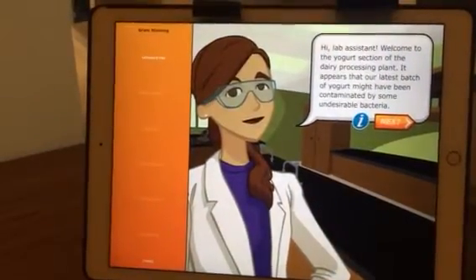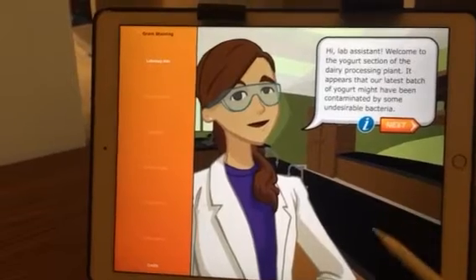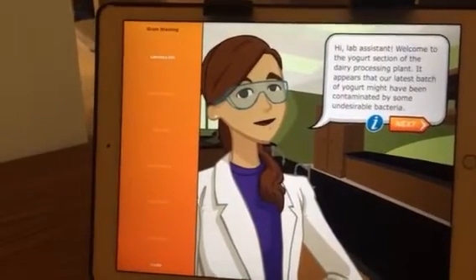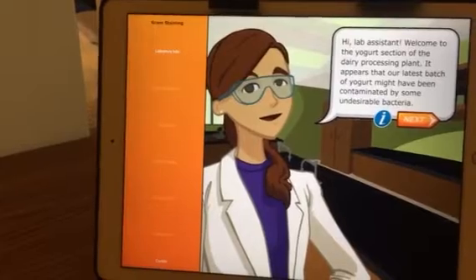Hi, Lab Assistant. Welcome to the yogurt section of the dairy processing plant. It appears that our latest batch of yogurt might have been contaminated by some undesirable bacteria.